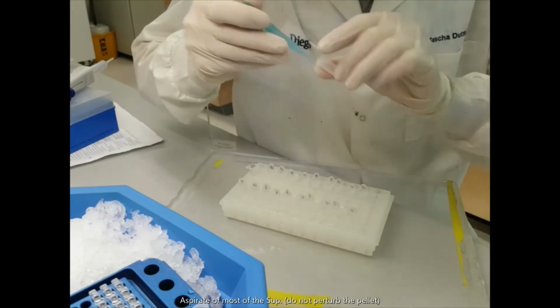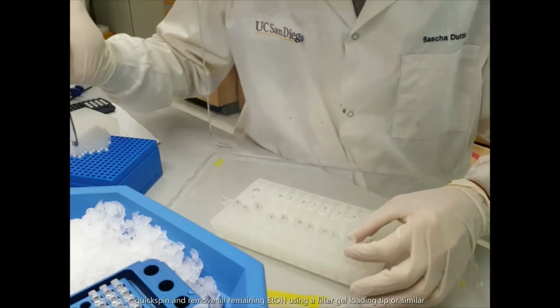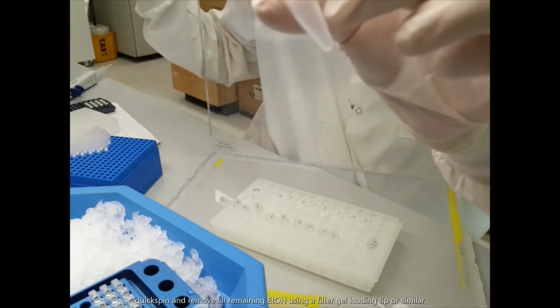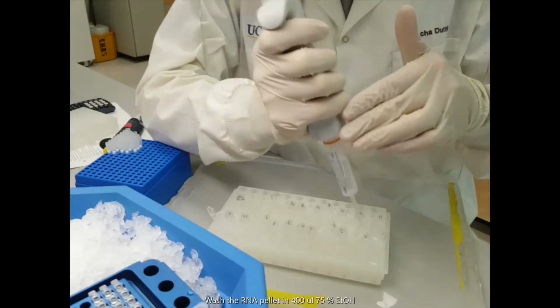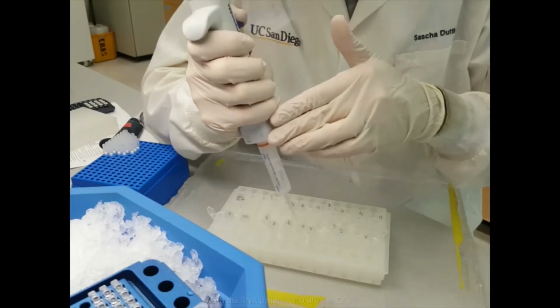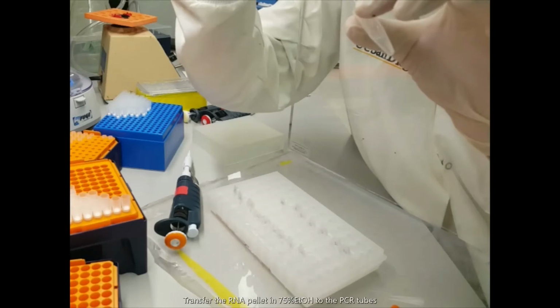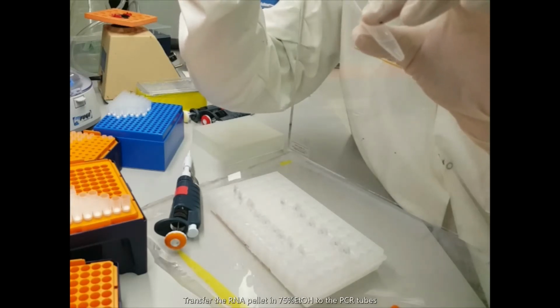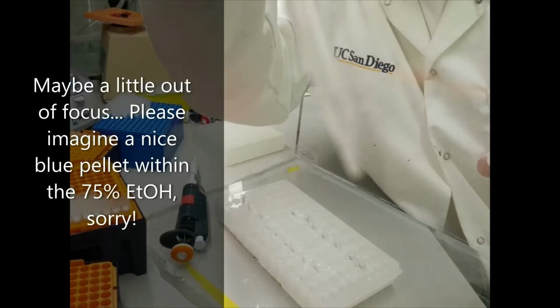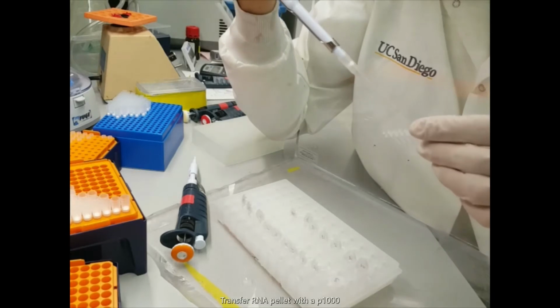Once the sample is done spinning, aspirate off the supernatant without perturbing the pellet. Quick spin the tubes and remove the remainder of the ethanol using a filter gel loading tip. Add and wash the RNA pellets in 400 microliters of 75% ethanol. To minimize the loss of material, we next transfer the RNA as a GlycoBlue pellet rather than resuspending it. To do so, pipette the pellet in 75% ethanol with a P1000 into the PCR strip tube.